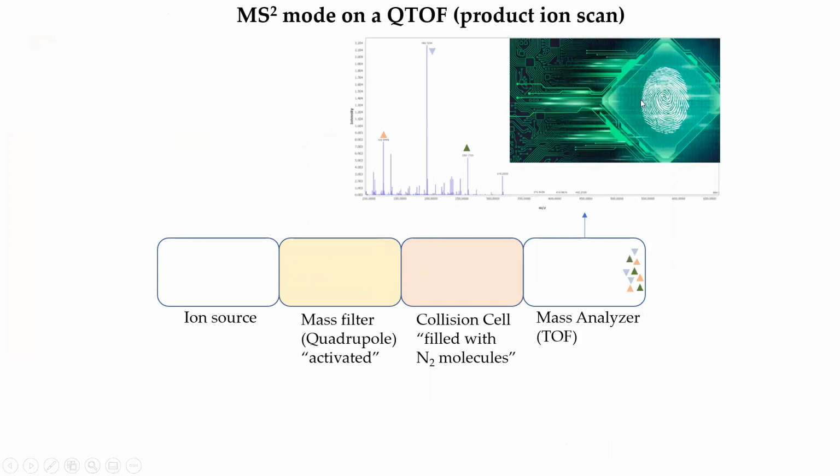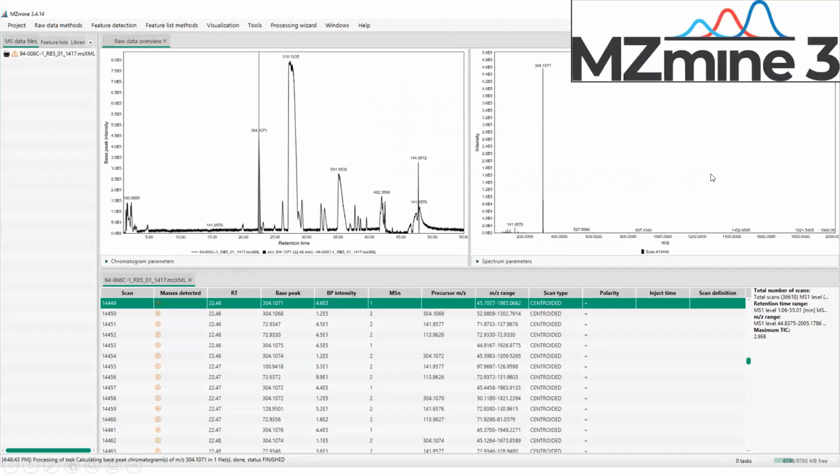And this is basically characteristic for each compound to a certain degree, and it works as a fingerprint that we can then use for database search to compare to spectra of known compounds, or basically match them to known compounds or compare them to known compounds that are similar in structure, and thus we get some insight on potential structures for ions we observe in our experiments.